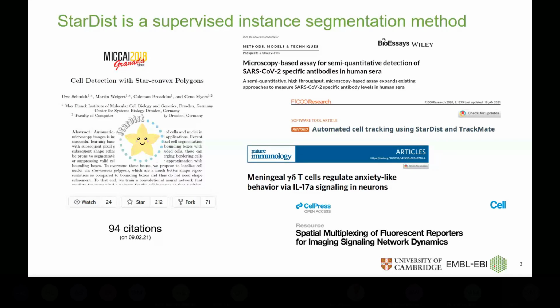With its excellent performance compared to the state-of-the-art methods, it has been quite popular in the community, and it has a growing user base. StarDist also has a well-developed Git repository. Already there have been quite a few works which have utilized StarDist in advanced applications in biology.